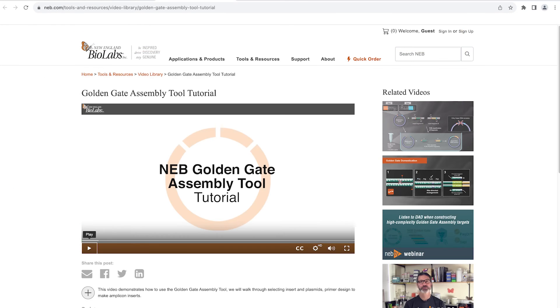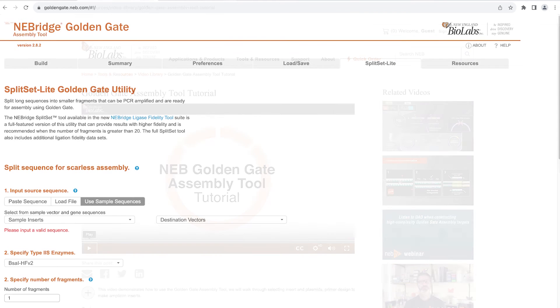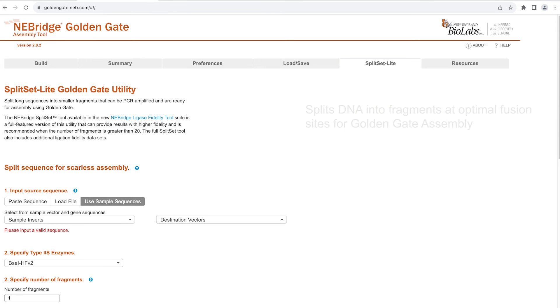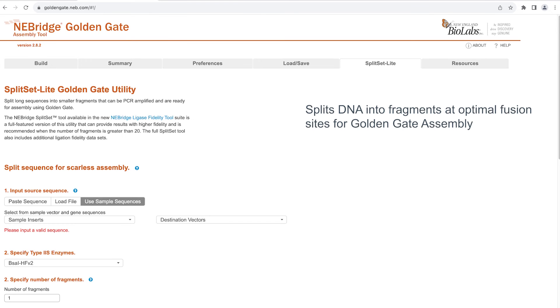A detailed video tutorial for the NEBridge Golden Gate Assembly Tool is available to assist you in planning your Golden Gate assemblies. The NEBridge Golden Gate Assembly Tool also contains the Split Set Light Golden Gate Utility. This feature splits long DNA sequences into smaller fragments at optimal breakpoints for Golden Gate assembly and provides primer recommendations. These fragments may then be used in the main Golden Gate Assembly Tool to verify assembly order.